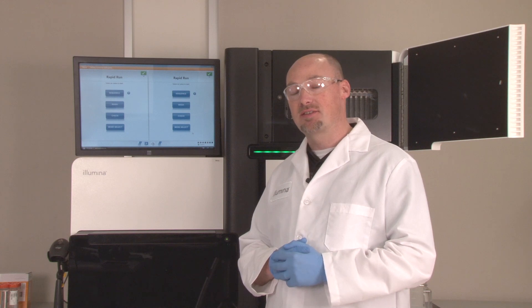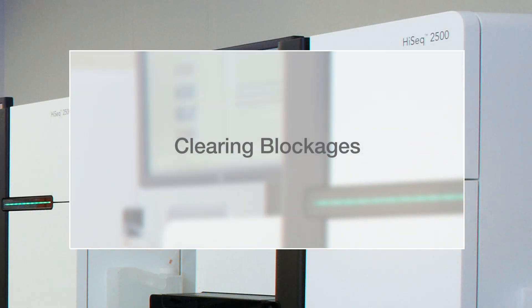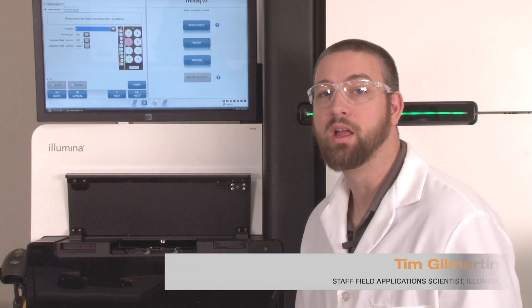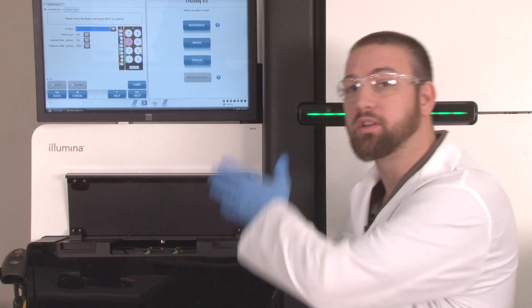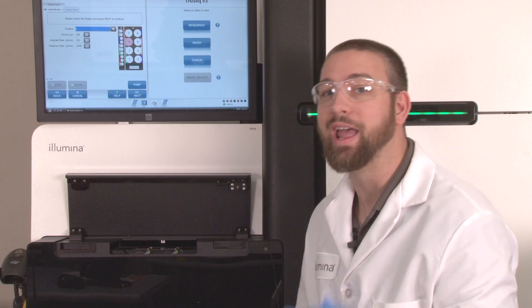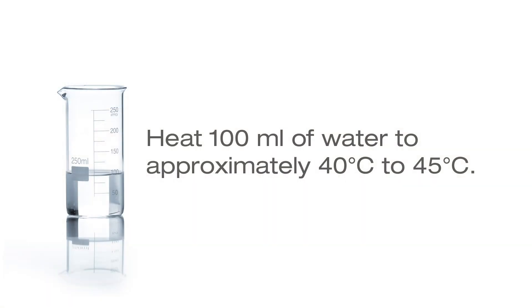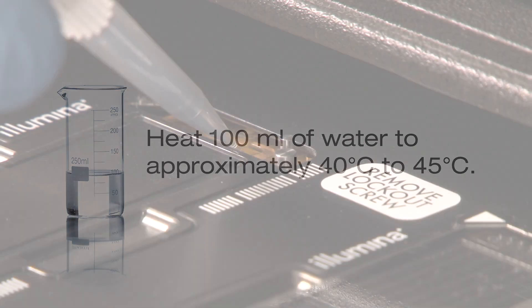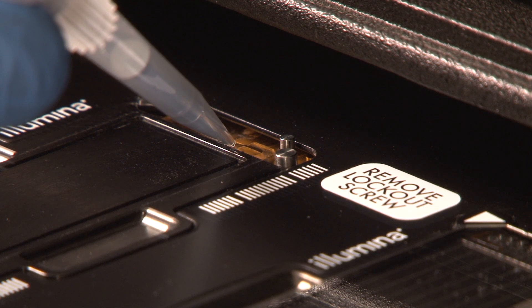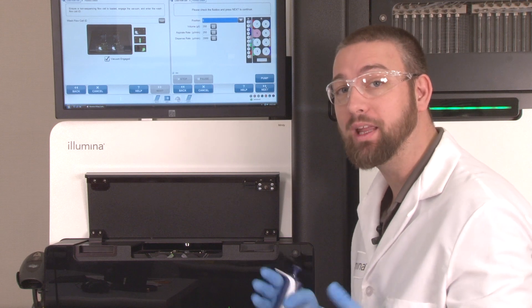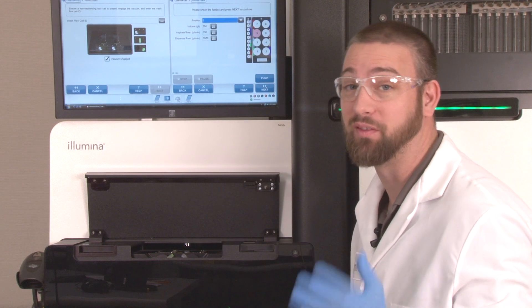Now that we know where the blockage is located in the fluidics line, we can try clearing it out. If the clog is from the outlet of the flow cell to the syringe pumps, you can clear clogs or large air gaps by performing a flow check and manually loading warm water into the outlets. We recommend heating 100 milliliters of water until it is warm, approximately 40 to 45 degrees Celsius. The warm water can help dissolve any salt deposits or solid blockages in the lines. To do this, remove the flow cell and gaskets and pipette the warm water into the outlet manifold well. The outlet manifold can only hold about 100 microliters in the shallow well, so be sure to add warm water continuously as it is drained. This process allows you to run water quickly through the back portion of the fluidics without introducing variables such as the flow cell or gaskets.